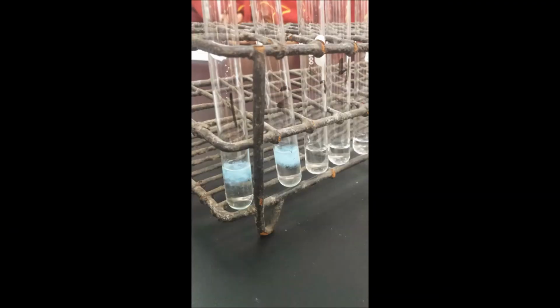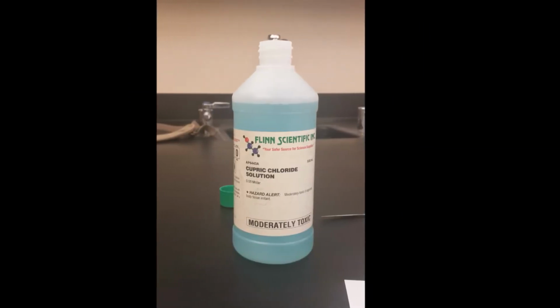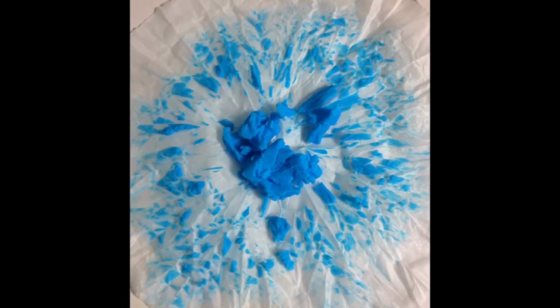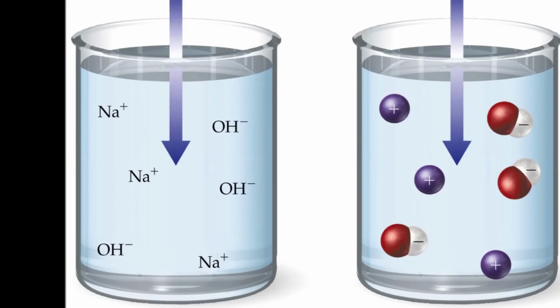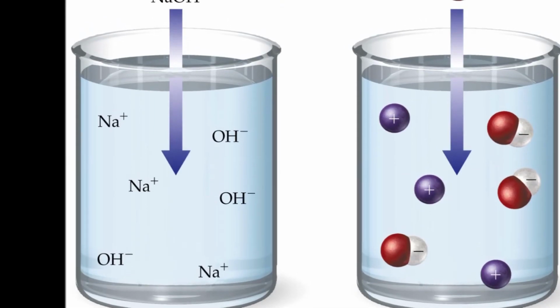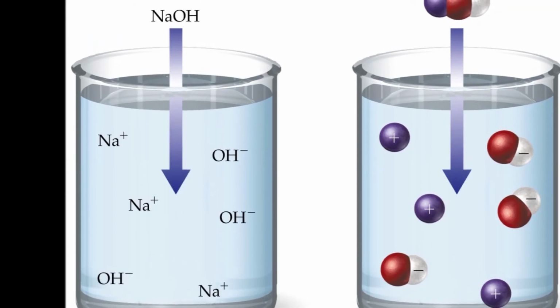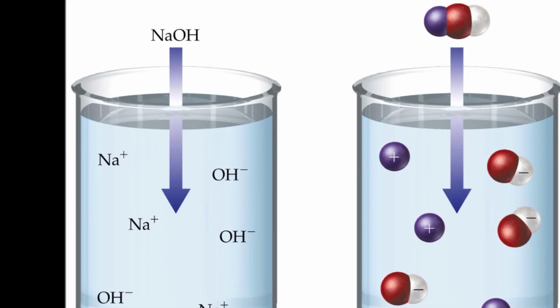The empirical formula for the product is copper-3 phosphate-2, which has the same ratio as test tube 5, both in simplest form. Copper and phosphate were combined with their ions rearranging, forming a new ionic compound that is solid, unable to dissolve, making it insoluble. These two ionic compounds, positive and negative ions, dissolved into free-moving ions, creating an electrolyte. Each ion had a 3 to 2 ratio in copper phosphate's crystal lattice. All this information can be found in the article Chemical Reactions Precipitation by De Leon.